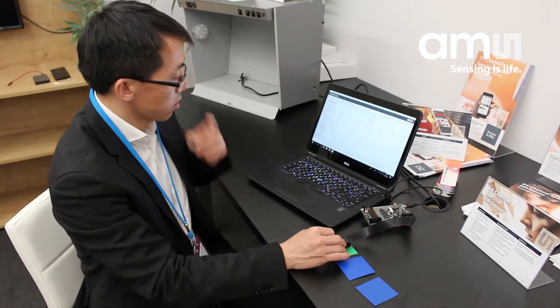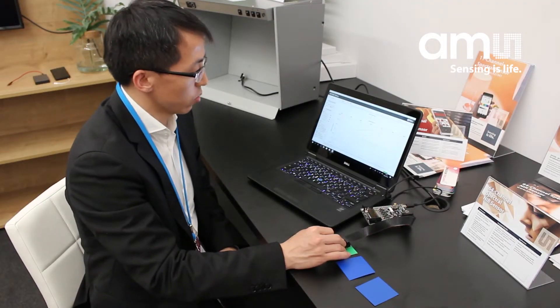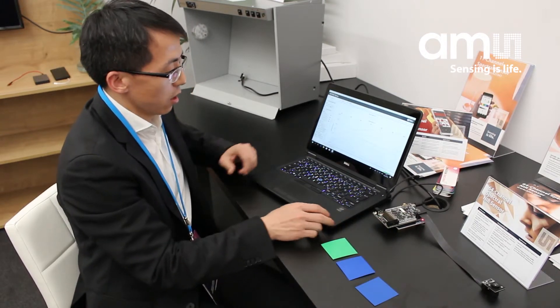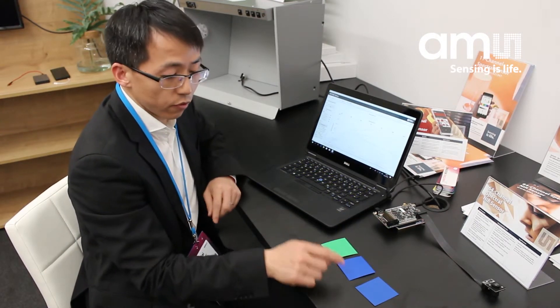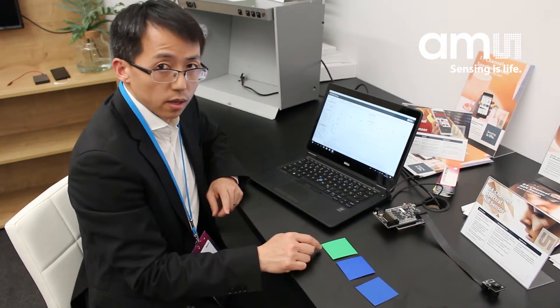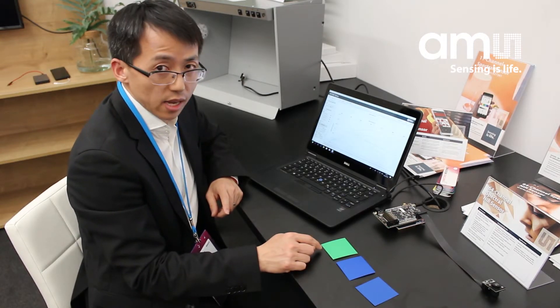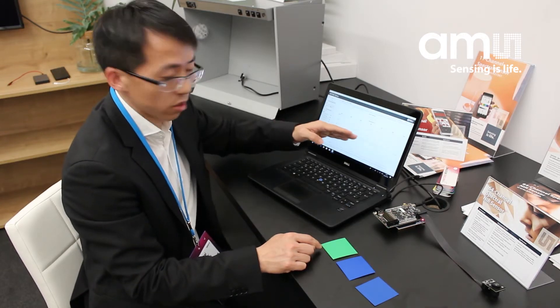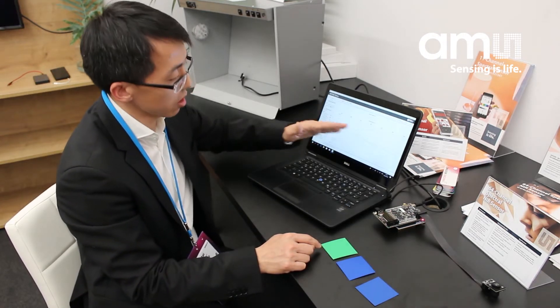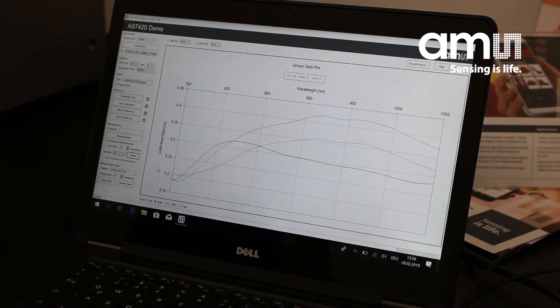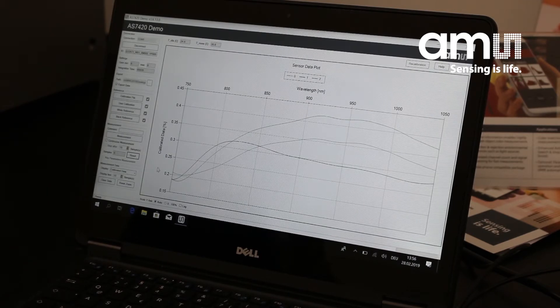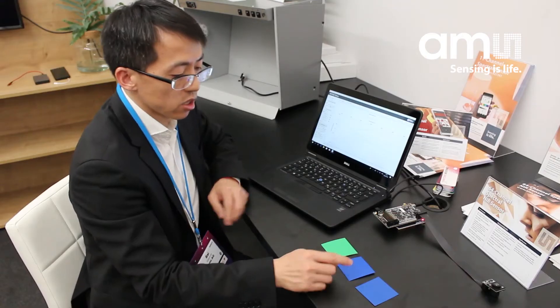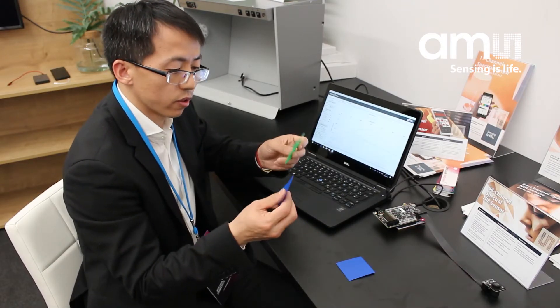Okay, so you will see that from the screen, the first time and the third time measurements have the same spectral response. Though the gain is different, the shape and the characteristic is the same. The second one, this dark one, is not the same.